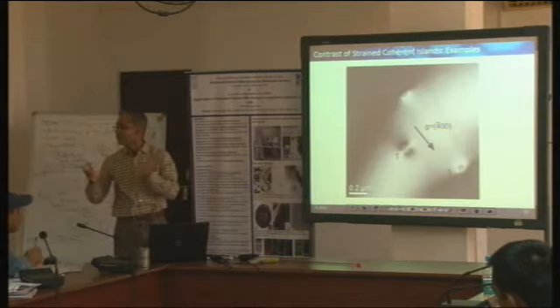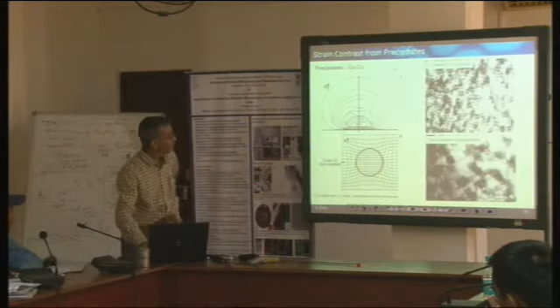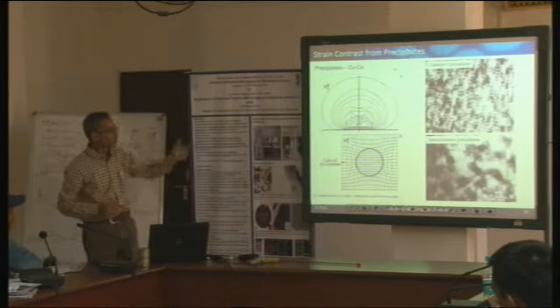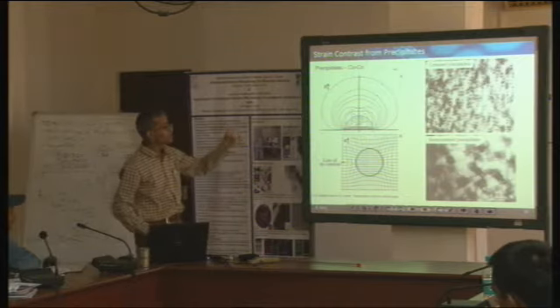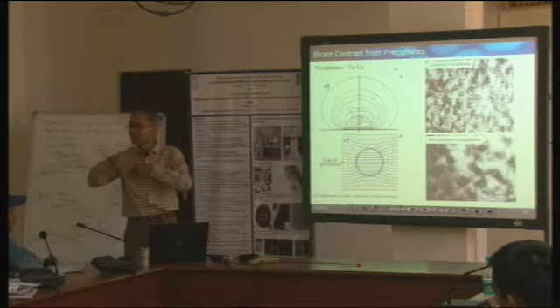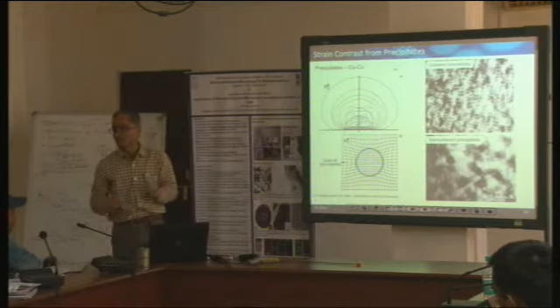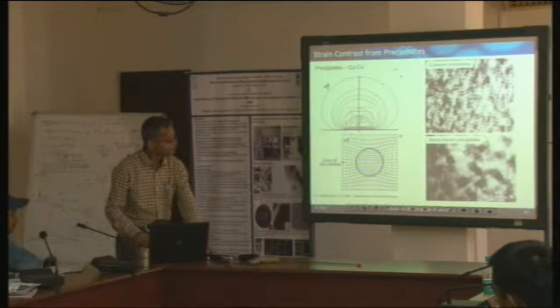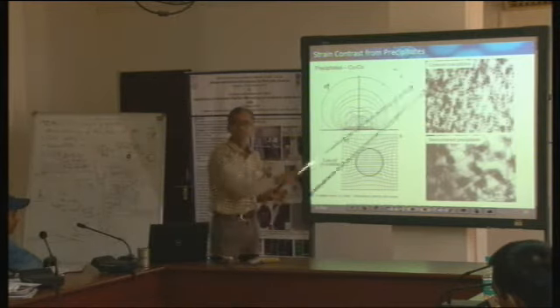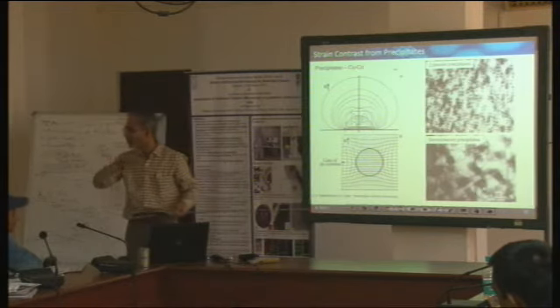Quantitatively you can also do it, when you do calculations, but I think the slide might be there. This is where it is a quantitative property. You have to do calculations about which I don't know much, but this is from a book and an example is there. People do calculate. Then you have to again make assumptions, parameterize, this must be that, match it with the observed images, and then you can make more quantitative inferences. There is also mention of semi-coherent precipitates and coherent precipitates. I don't know the difference, but unless you tell, we will just stick to it.